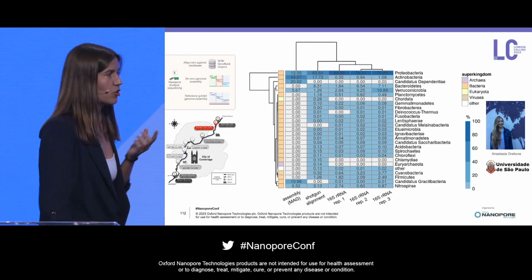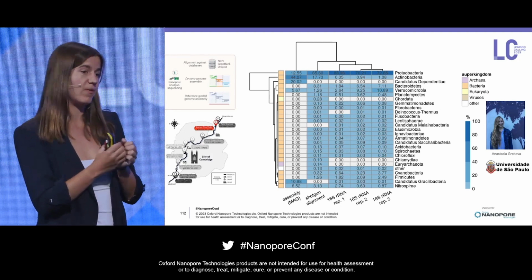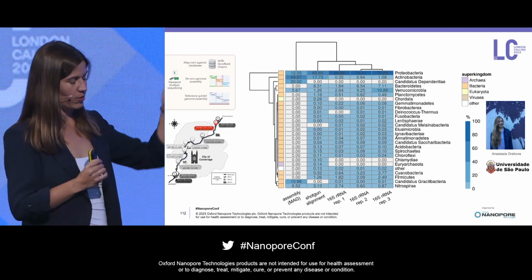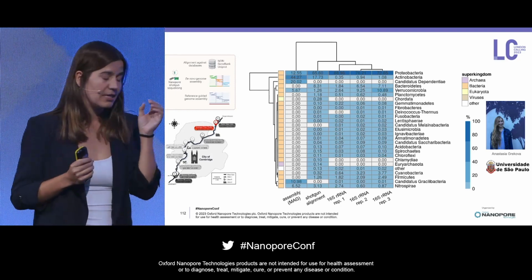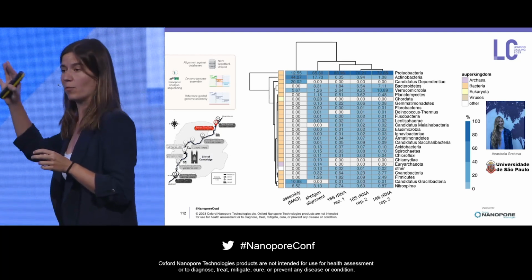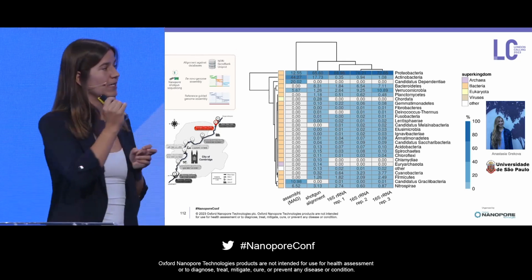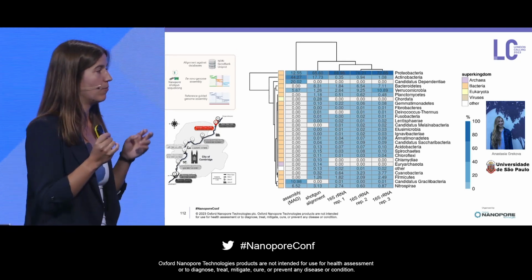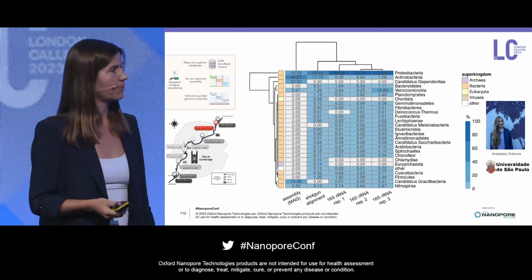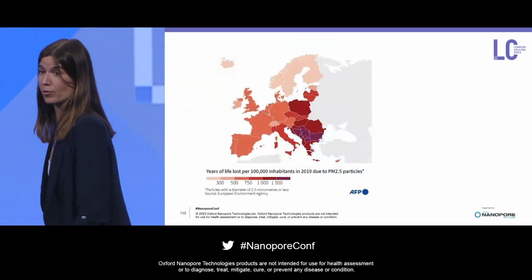At the same time, we see that the shotgun alignment-based approach in terms of quantification actually correlates very well with the amplification-based approaches. And so this really showed us, and please refer to Anastasia's poster for more details here, that shotgun sequencing approaches have a lot of promise, because we can get a rough quantification of microbial taxa using the alignment-based approach, while the assembly-based approach can give us an idea of the functional annotation of potential pathogens as well.